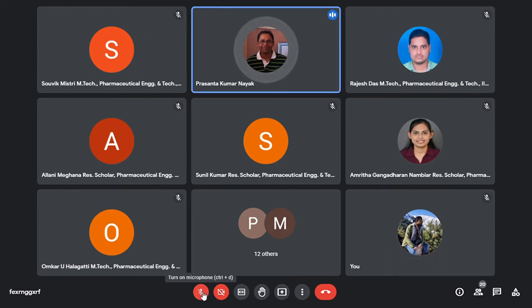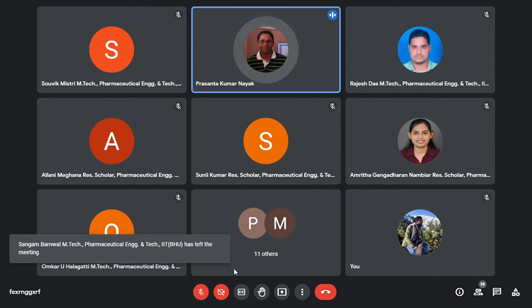So as you go on increasing the image bit type, it will increase the size of the file as well, right? So that makes this processing very slow. So we have to keep it at the minimum, because in this particular image we are specifically interested in one color, so we need not worry about that, right? So we have to keep it at the minimum.